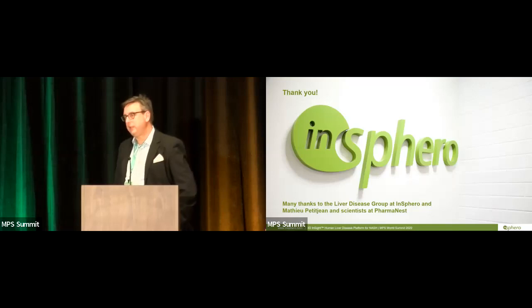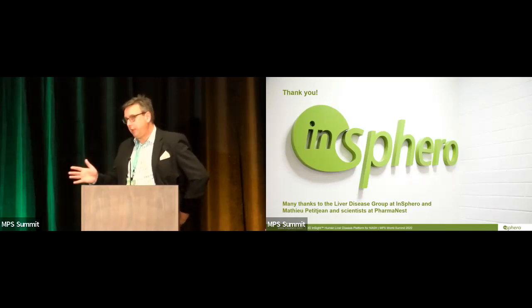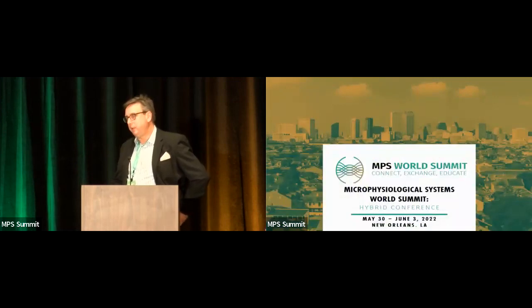Yeah, definitely. So I think in the current setting, from the 90 biopsies, and this is not a large number, I'm totally aware, right? We've selected 15 for a blinded validation test, or qualification test, I should rather say, and the others are used for training the system.